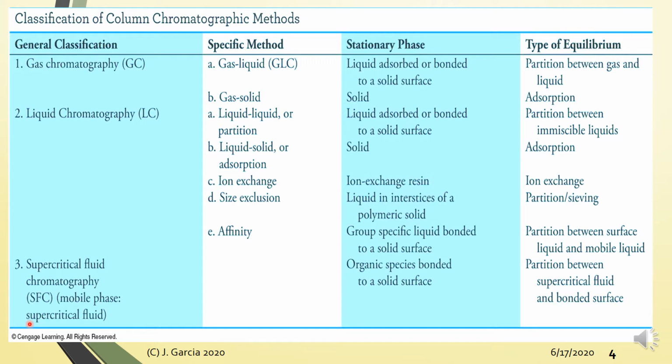The number of theoretical plates, column efficiencies, and resolutions are in general equivalent to that of gas chromatography, even if you are processing samples that are for liquid chromatography.